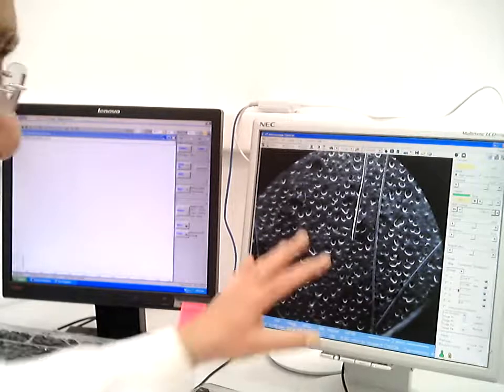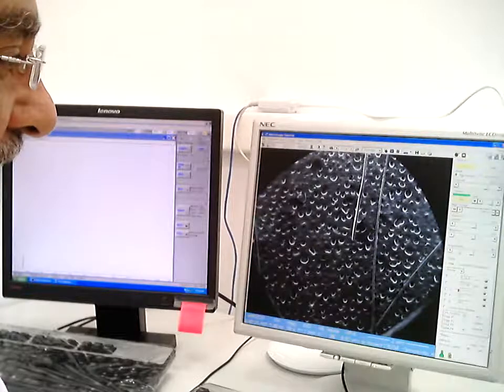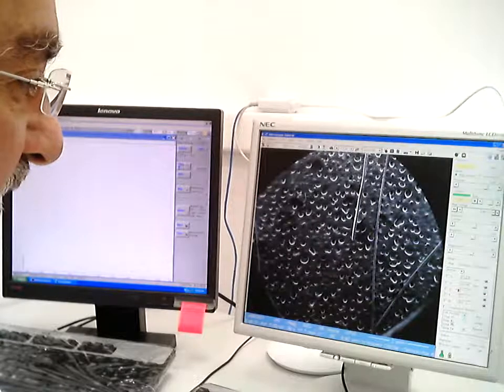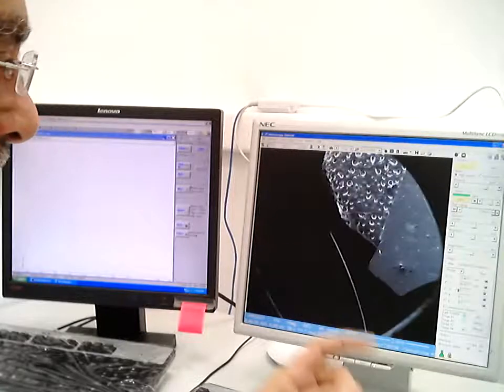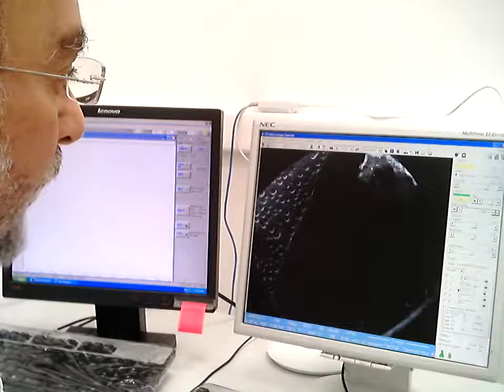So this is one part of the investigation of hair. We can find out if any animals were nearby or anything like that. Now let's look at something else. A second piece of evidence that we collected was a piece of glass, and on the piece of glass there was a tiny amount of a material.